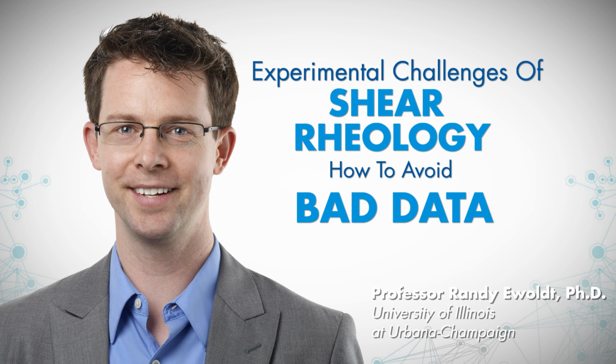It might help. There are some cases where the slip doesn't occur until a critical value of the torque or the local stress, and so you can potentially avoid it. So it depends what you're trying to measure. If you're trying to measure, say, linear viscoelastic properties of a stiff gel, then definitely being at those lower torque values, lower displacement values, does allow you to make those measurements before slipping. So for example, if you picture gelatin again being in the rheometer, and even if you have smooth plates but it's sticking well enough, you might be able to get away with measuring in the linear viscoelastic regime at suitably low torque values before slipping. So I hope that answers something.